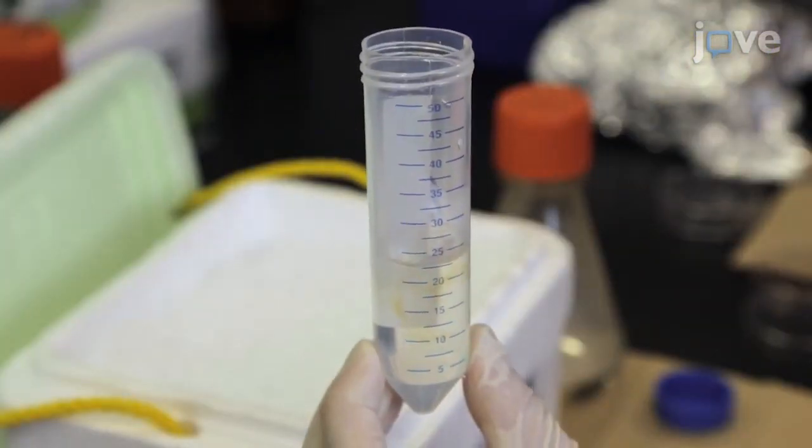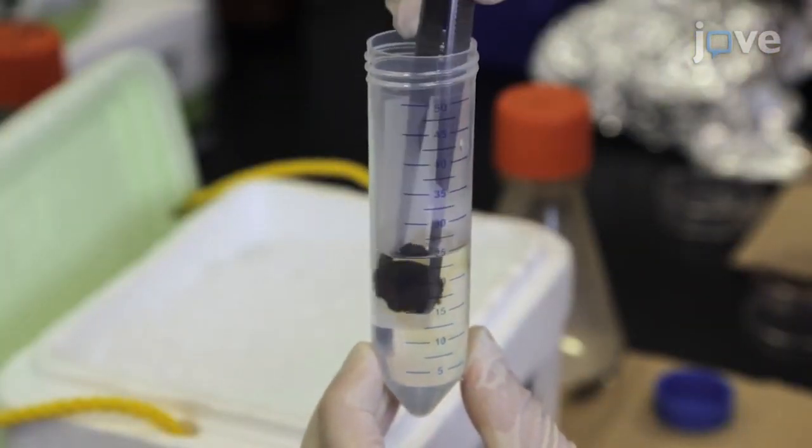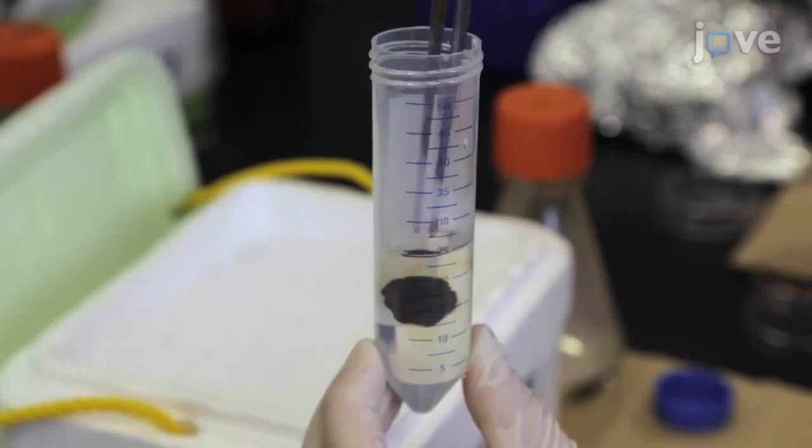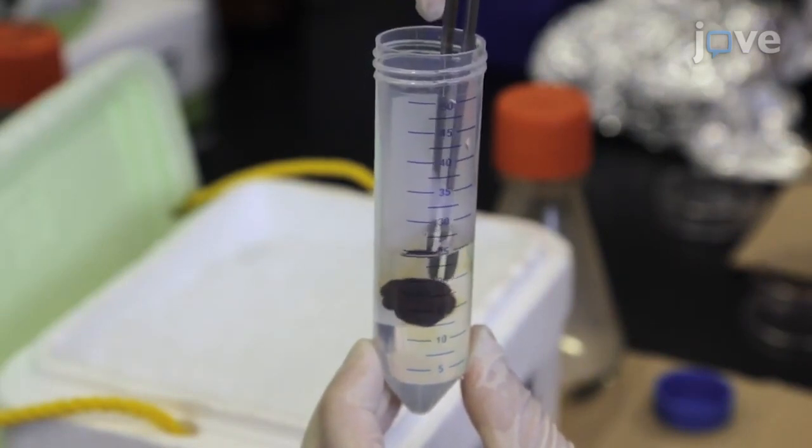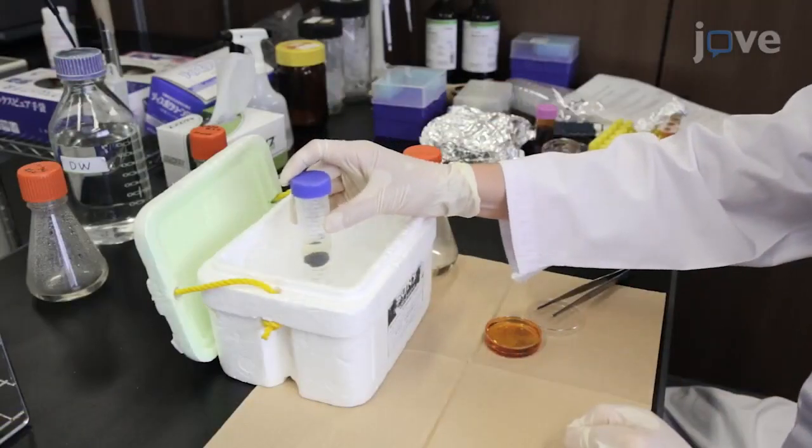Use forceps to place the specimen within the agarose. Adjust the position of the specimen so that its body axis is vertical. Harden the agarose on ice.